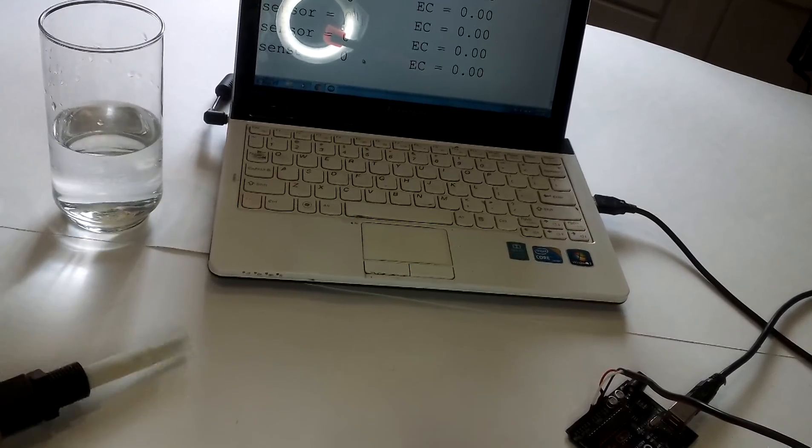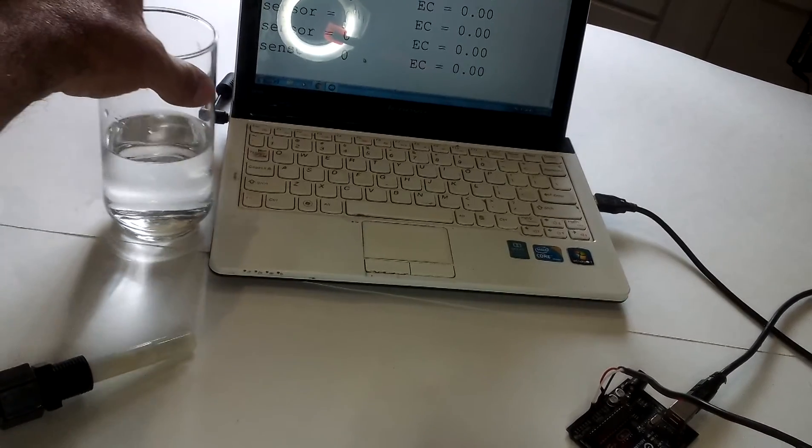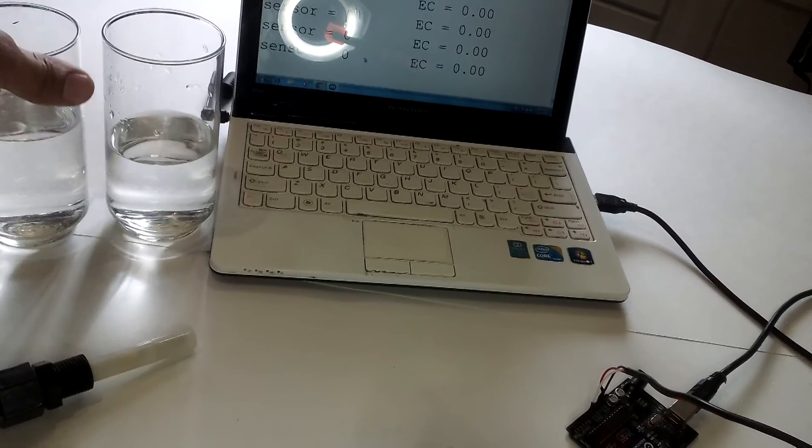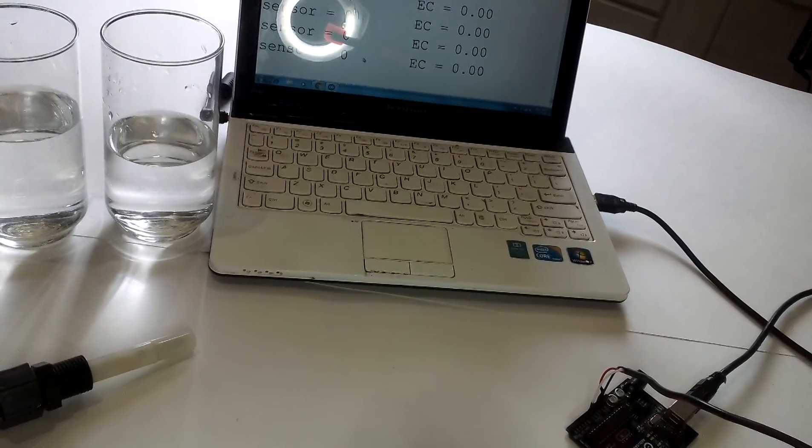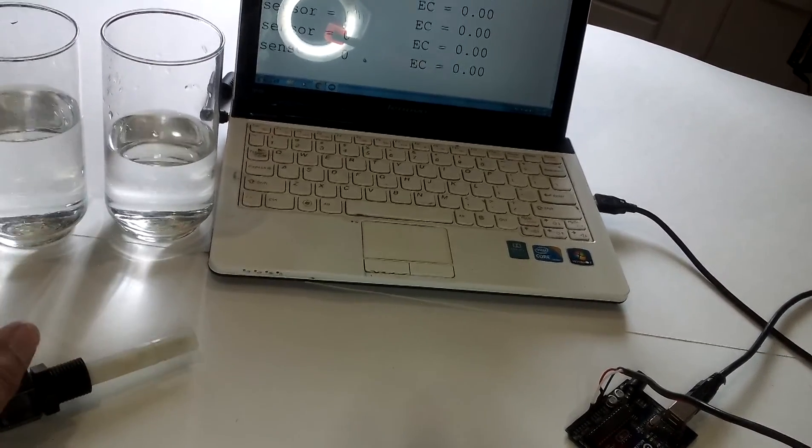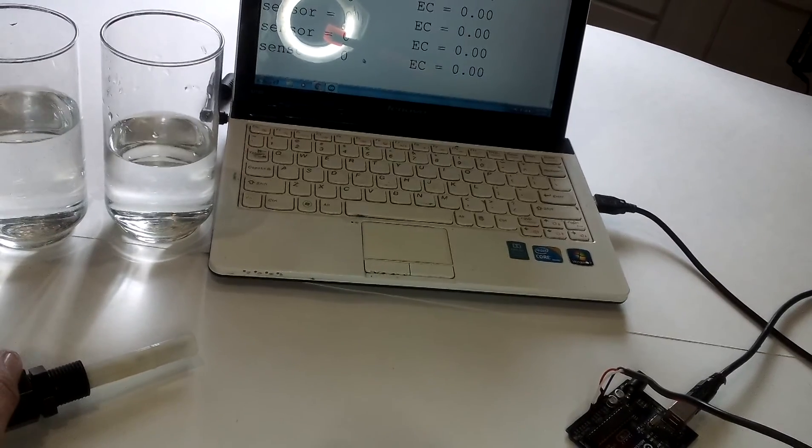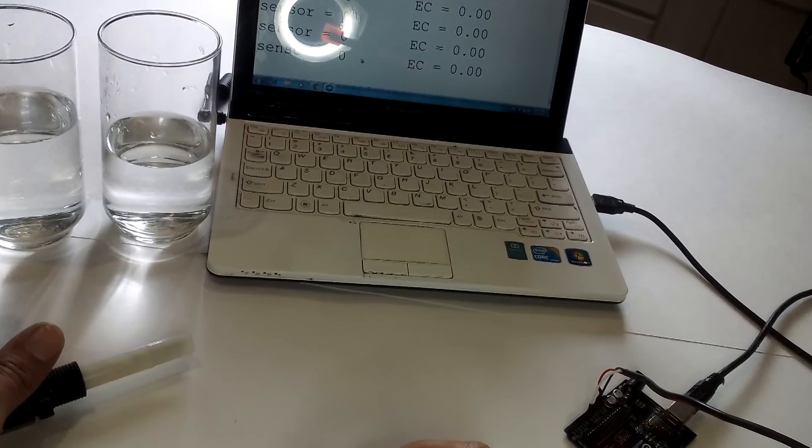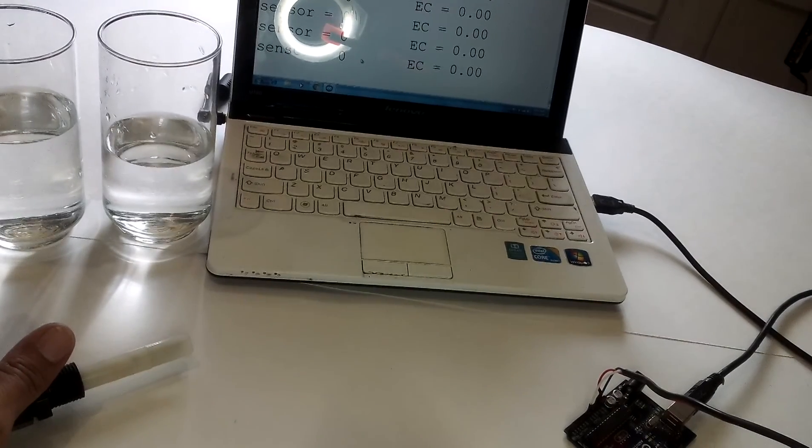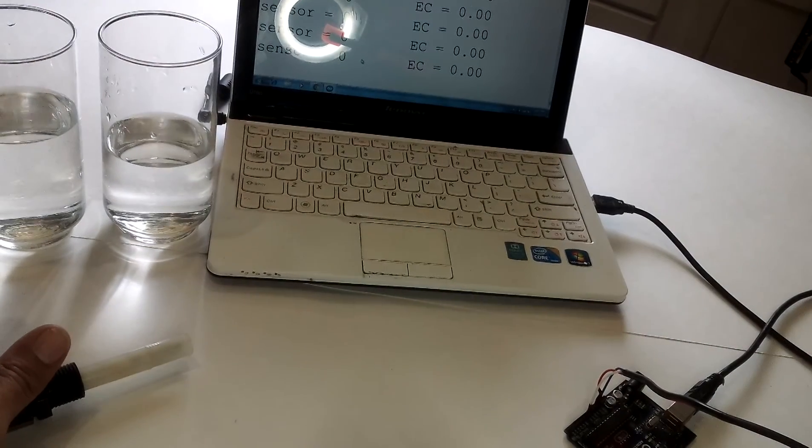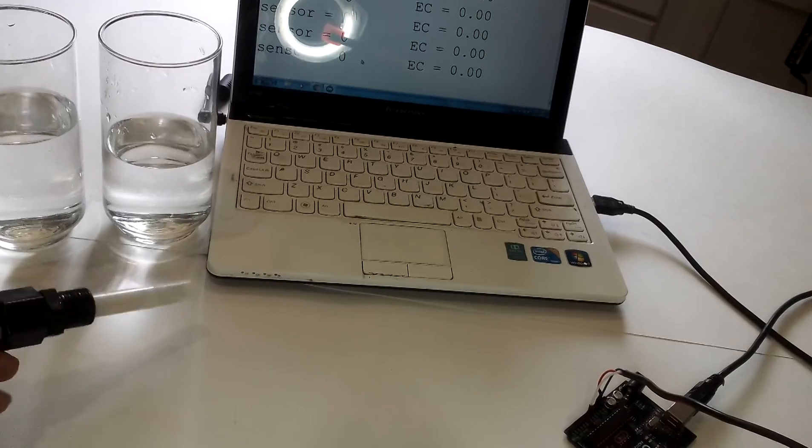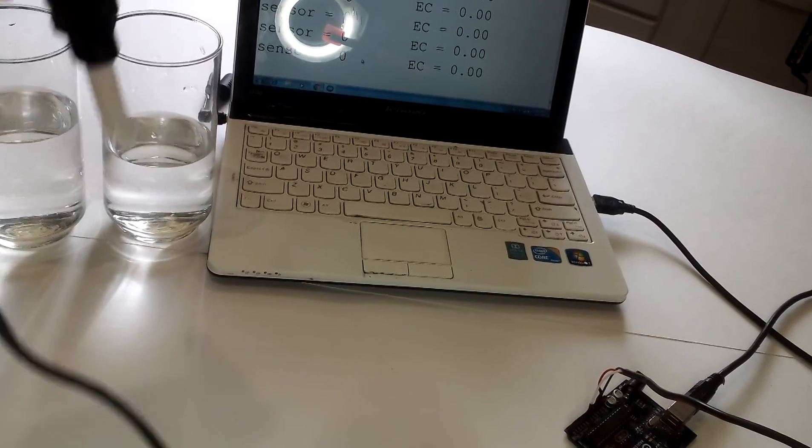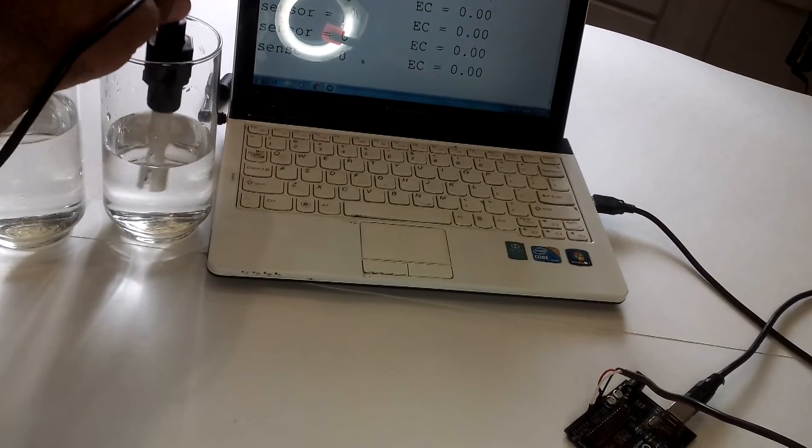And I do have known solutions here. One is tap water. Pretty dirty tap water actually. It's about 610 microsiemens. And I do have a known solution of 1.24 conductivity solution. And we're going to insert this into tap water first.